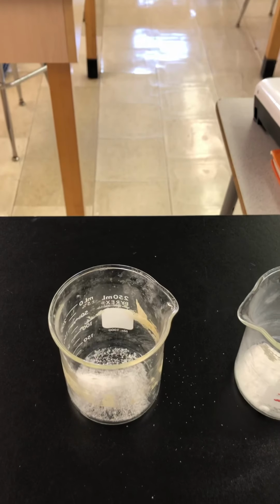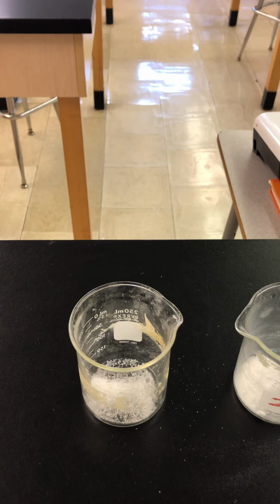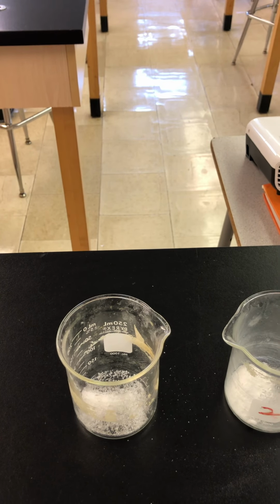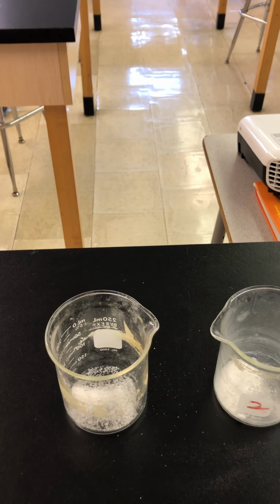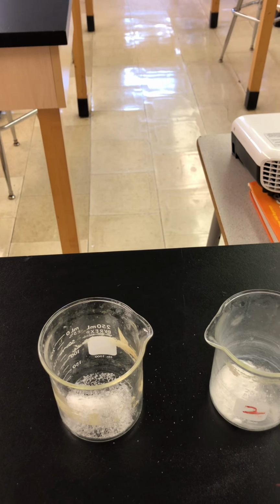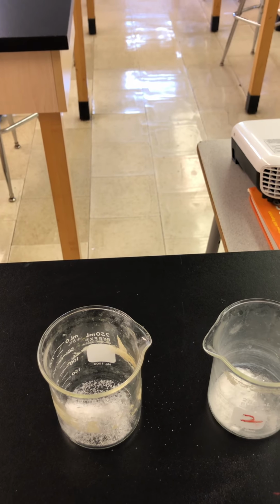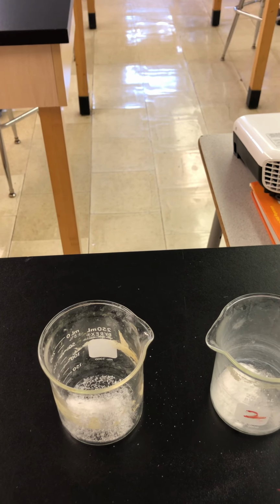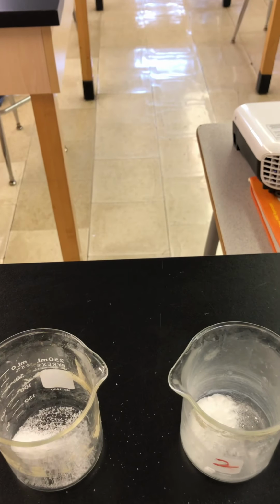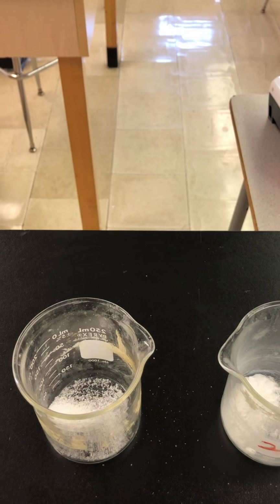Solid 1 we will start with. So what I would like you to do is I'm going to put my phone closer to the solid and I would like you to fill in on the observation table color, clarity, and crystal shape if it applies. If it is not a crystal, you would put N/A. If you can't see the crystal very well, then you can just say, yes, it has a crystal shape.